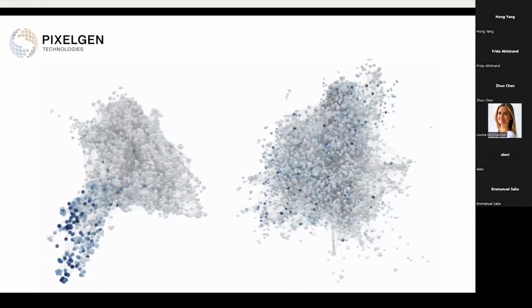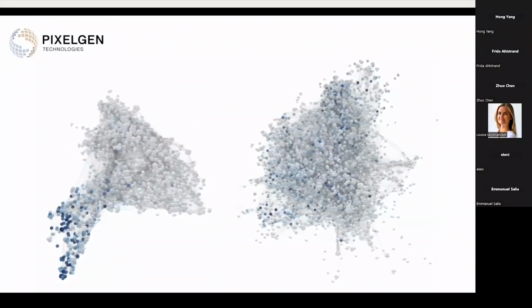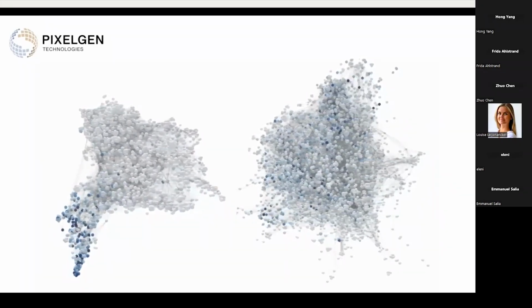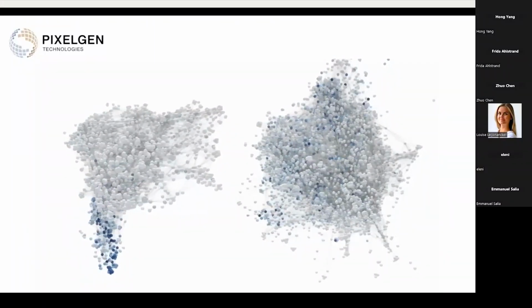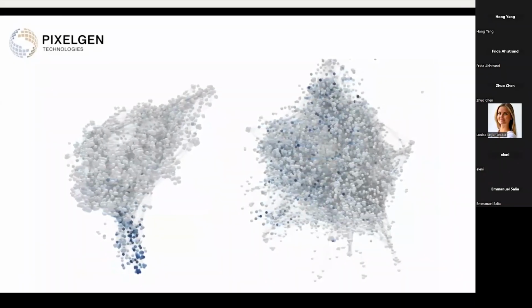And yet another way is to form these graphs as well and to look at them from all angles. So here we're looking at two different cells. The one on the left is a uropod forming cell, a stimulated cell, and we've highlighted the abundance, so the nodes in this graph where the uropod proteins are present.